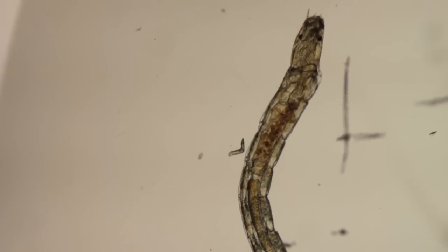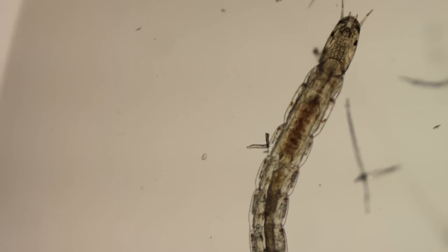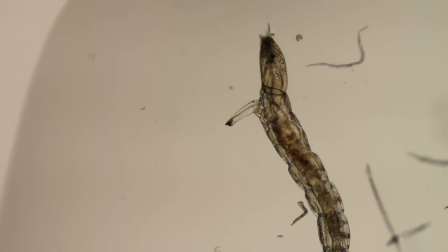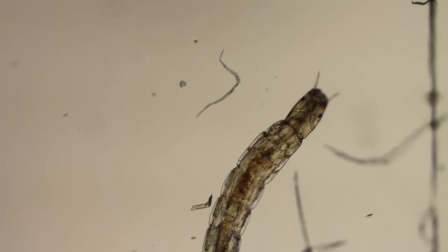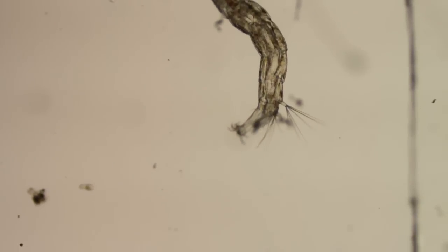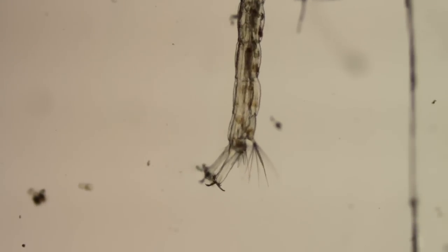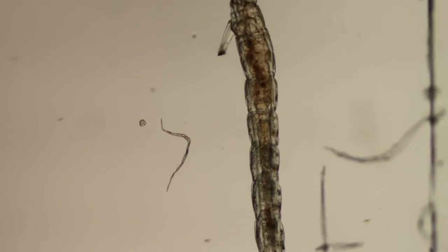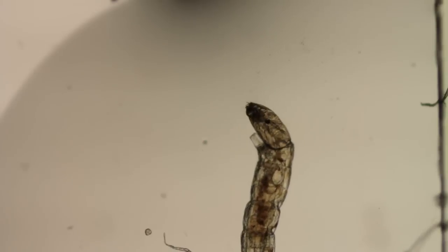This little guy is a Chironomid, a type of midge larvae. I'm not sure if he's a biting or non-biting species. I pulled him out of my aquarium this morning. I couldn't see him until I got him on the slide and under the microscope, but he was either in the water or attached to the spine of the aquarium plant — it's called a hornwort — that I plucked out with my tweezers.